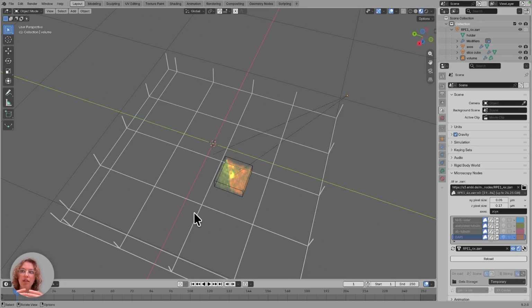This is slightly slow because there is some disconnect between the loading from ZAR and writing to local files. So be warned that this might take a while, but after that you will have quite a responsive thing with high resolution. So I'm going to press reload right now with the largest resolution and only the centrioles selected.